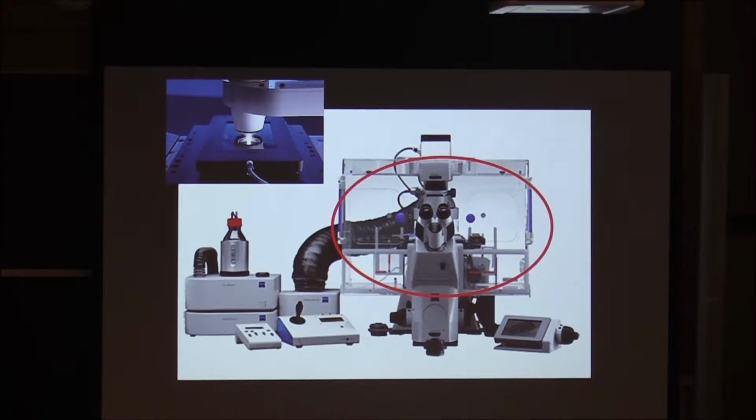The larger the volume around your microscope that you can get to the temperature you want, the less you're going to have to worry about thermal drift, expansion and contraction of the various materials within the microscope. Of course, the ultimate way to do this, and I've seen lots of labs that do this, is just turn up the temperature in the entire room to 37 degrees.